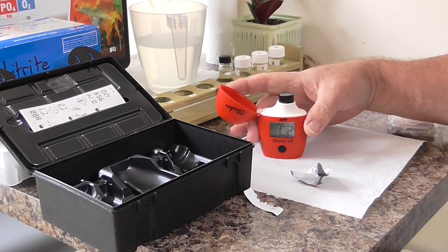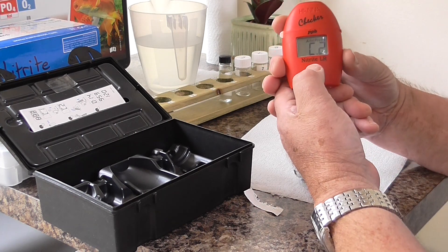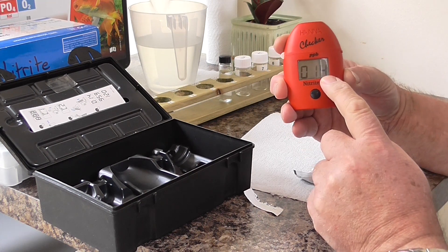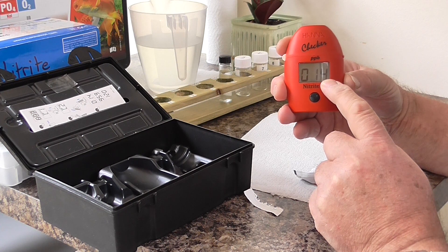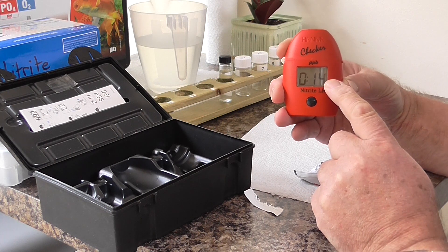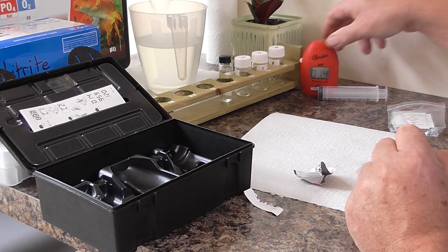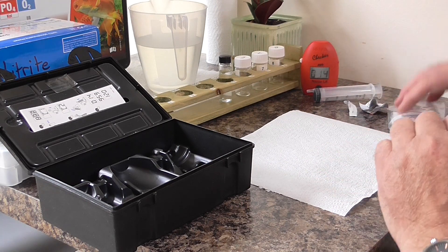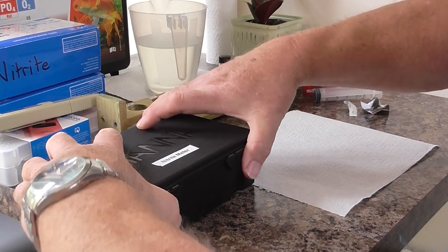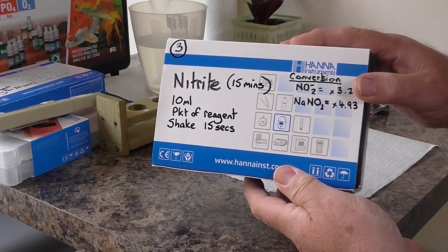Put that in the meter, shut the top, press and hold. This test is going to take 15 minutes, so it's timing it through. Put that down, reagents back in. So that's the nitrite started.